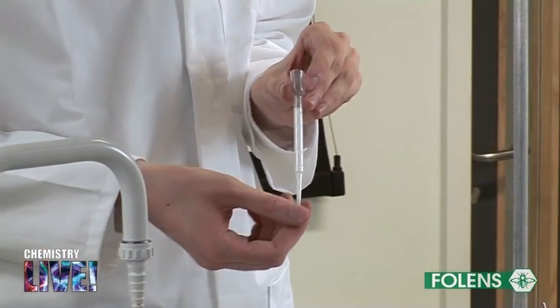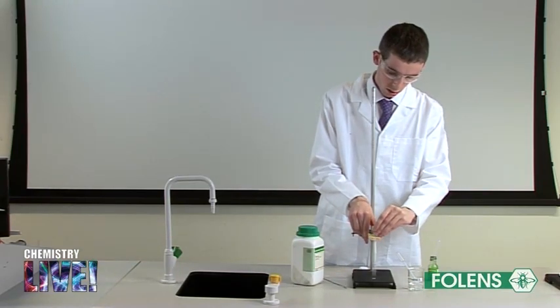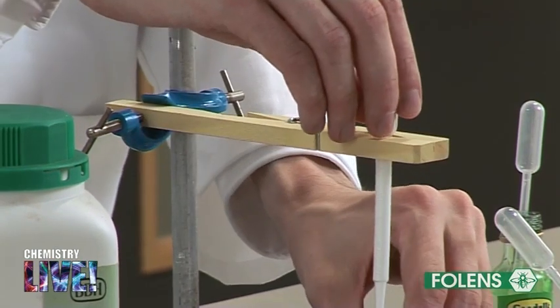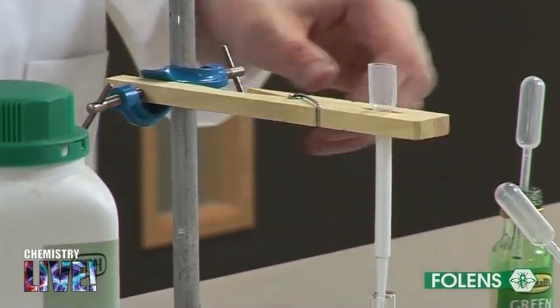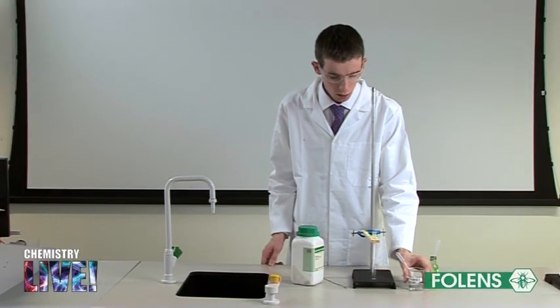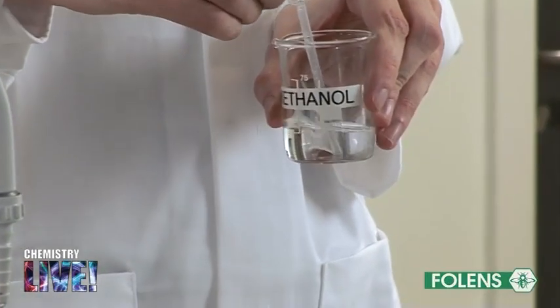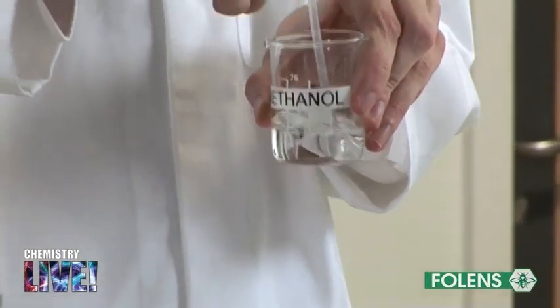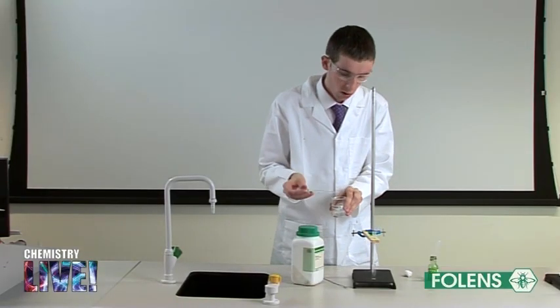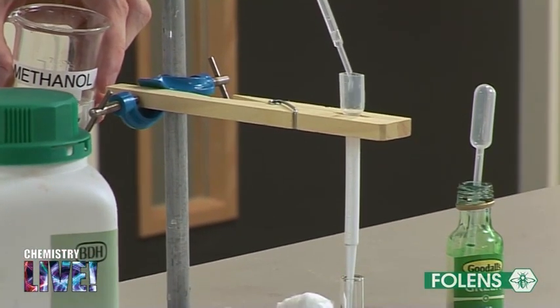With the aid of a test tube holder, the plastic dropper is allowed to stand in a sample tube. Using another dropper, add about 3cm cubed of methanol to the column and allow it to drain through.